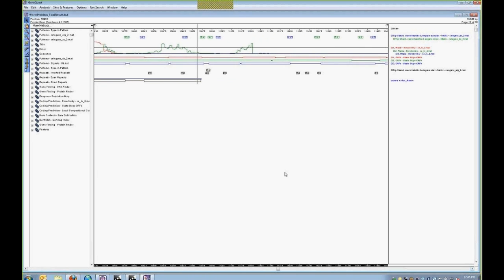And continuing down, we now see one more peak, again not only in the second frame, but in the same open reading frame as exons 2 and 3. We look for our acceptor site. In this case, we see one right here with a score of 15.1. And we go to the end of our Borodovsky peak, and there really aren't any donor sites here. And we also see the end of our open reading frame. So this may indicate that we've actually reached the end of our gene.